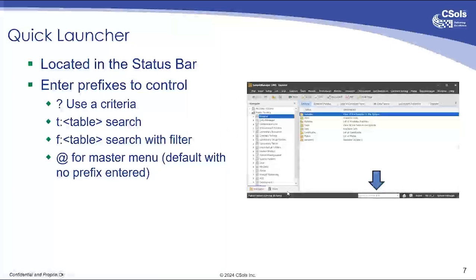However, you can type in directly some master menu numbers. So you could just type in, say, 247 is, I believe, results entry by sample, or VT for view table. You could put in the text mnemonic.